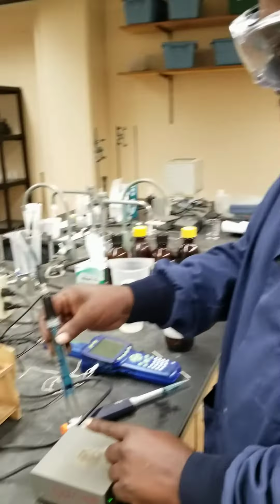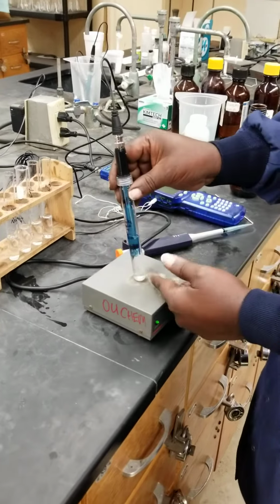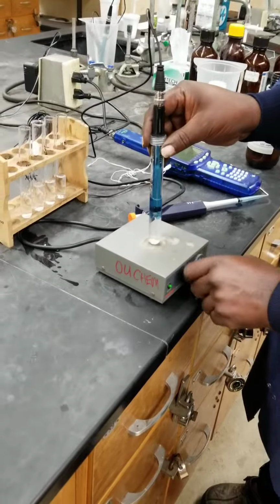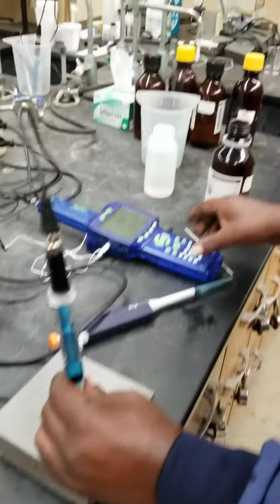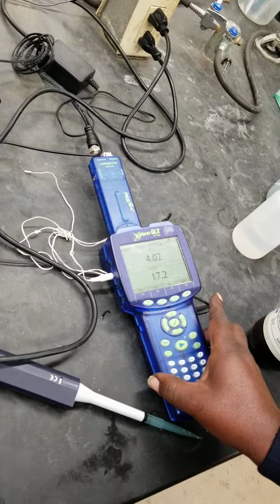So I put in a little stir bar there, and I stir the solution, just to make sure they're nicely mixed. You can verify it's mixing. You can see the vortex at the top there. I turn that off, and I read the pH. So let's call this 4.02.